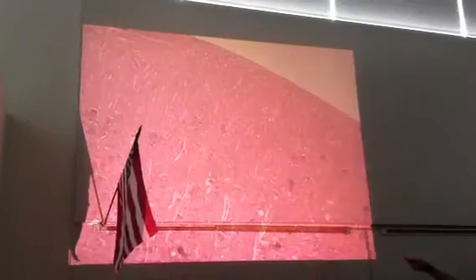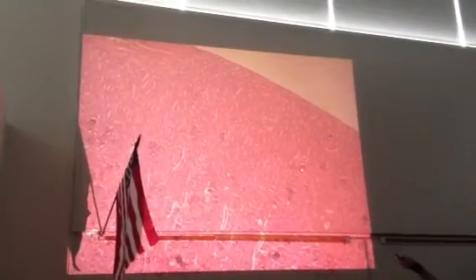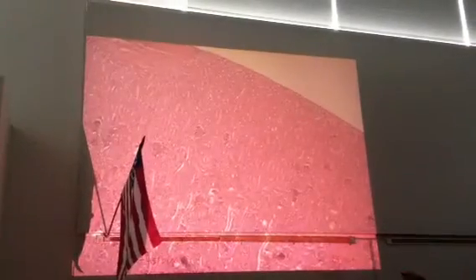Okay, so the edge of the kidney's up here. So this is cortex, and the structures we see, like there's one over here, here, all the things I'm pointing to, these are renal corpuscles. And the space that you see, well, it's a tuft of capillaries called the glomerulus, and the space around it is called the capsular space, and that's where you collect the filtrate.